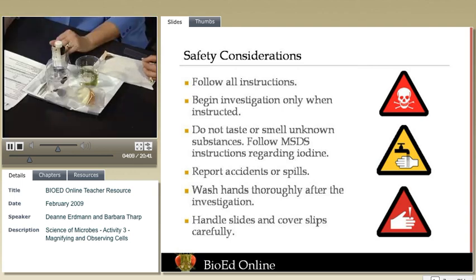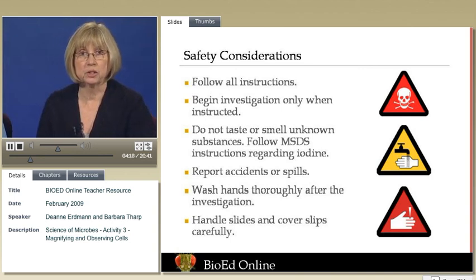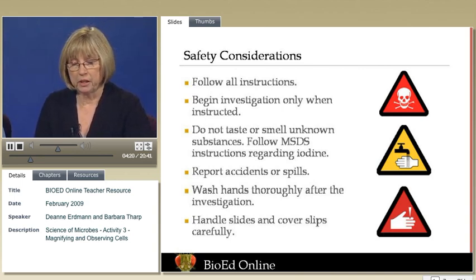They do have plastic ones as well, but we do make sure that if it's glass, it's taken care of, and if it's broken, it's disposed of properly, which means in its own container, carefully contained.